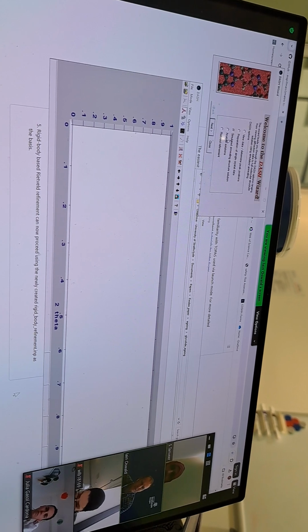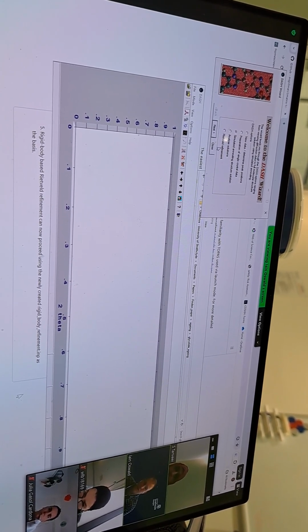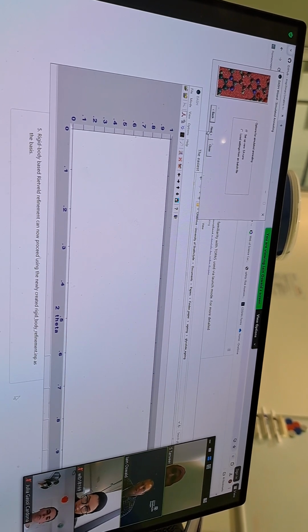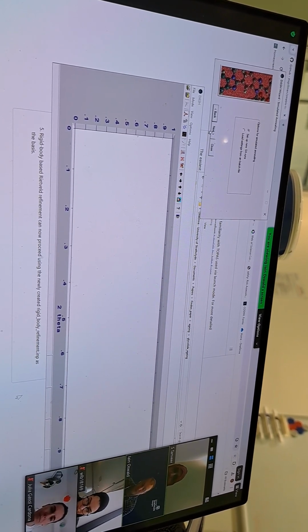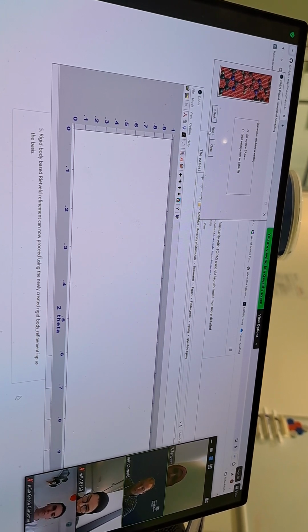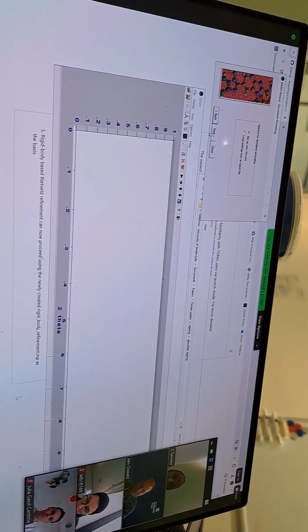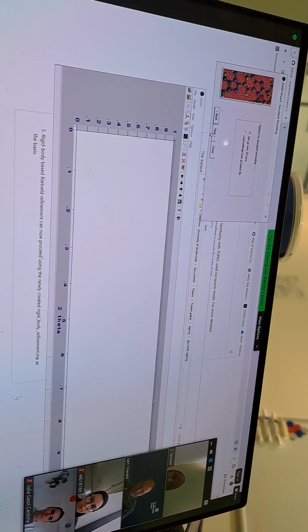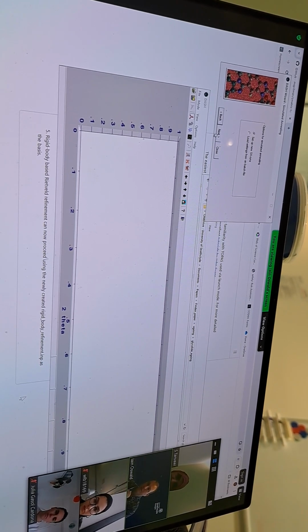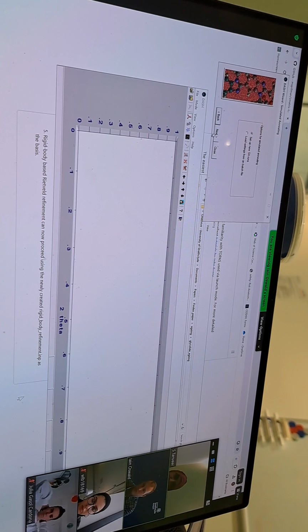Otherwise, you can skip to this simulated annealing structure solution. Here we're putting in a molecule of our system, and then it inputs it into DASH for DASH to do stuff with. Now, we're not necessarily trying to solve the crystal structure here. If we are, that's great. If we're not, if we're just trying to get a molecular description of it for use in Topas, then we can just go through this process here.